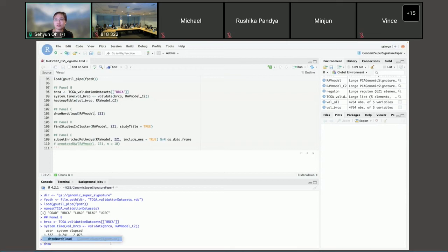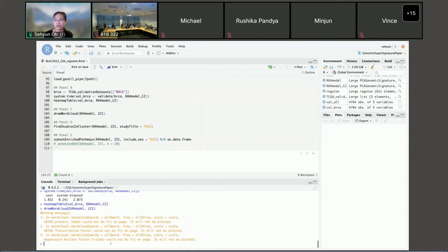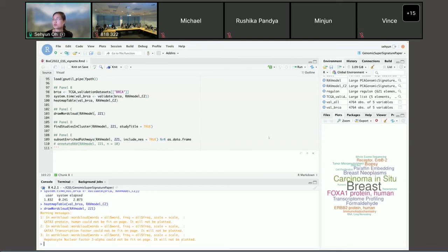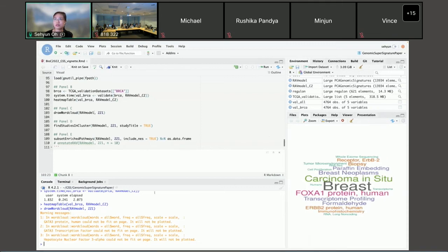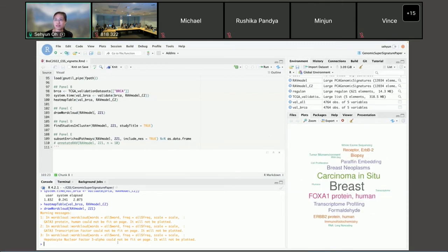I loaded the dataset, which is a list object containing five different TCGA datasets. I run validate again and display the heatmap — RAV 221 shows one of the highest validation scores. Then I draw the word cloud for RAV 221 and use findStudiesInCluster to find relevant studies.